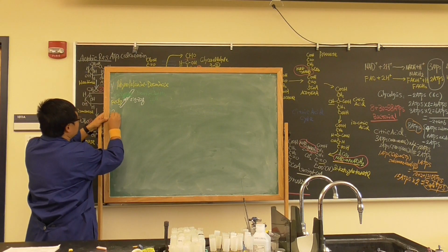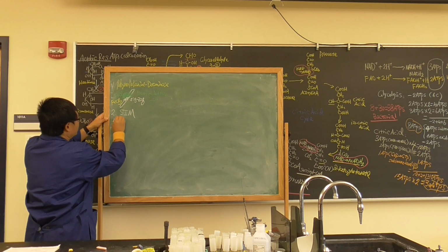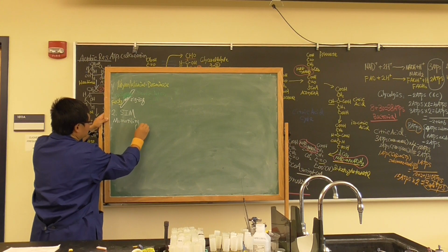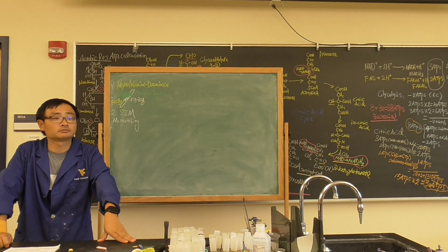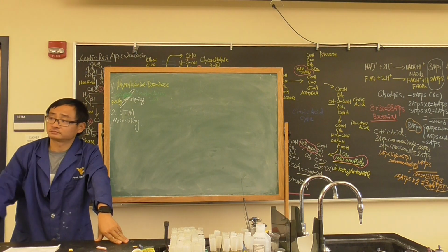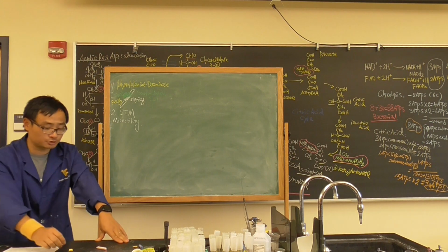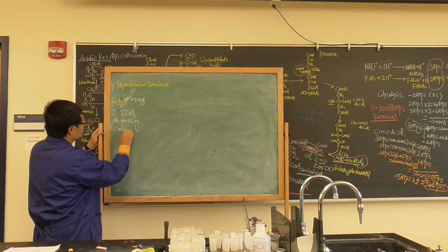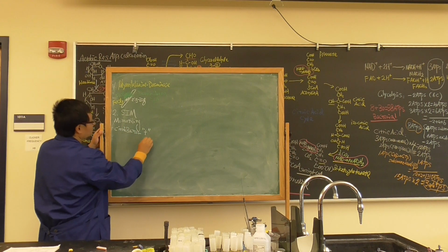Phenylalanine deaminase test. The second one, SIM test. Okay, let's talk about the M, motility. Whose bacteria goes everywhere? That is positive. You see the black one goes everywhere, positive. So at least what you see, Citrobacter is positive, is that right? Citrobacter is positive because it goes everywhere.